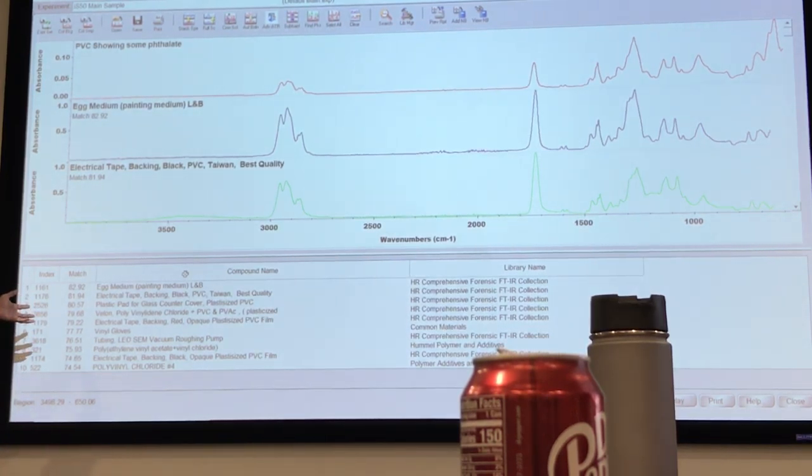That's why it is now matching to all these commercial materials, because this is already there in the library. But in your case, you only had a PVC spectra. You don't have all this, right? And think in terms that you don't have any of these commercial libraries. You don't have all these to even think about, oh, is it looking the same? What should I look for?